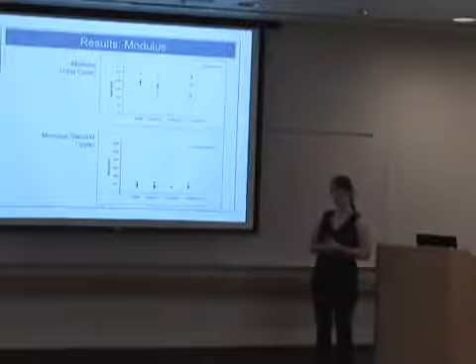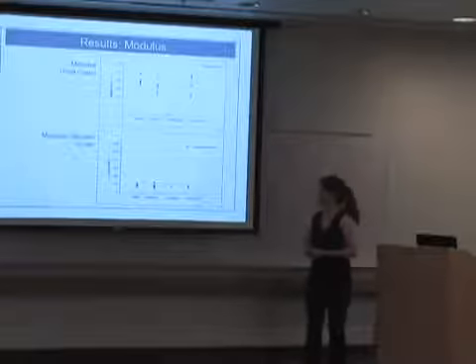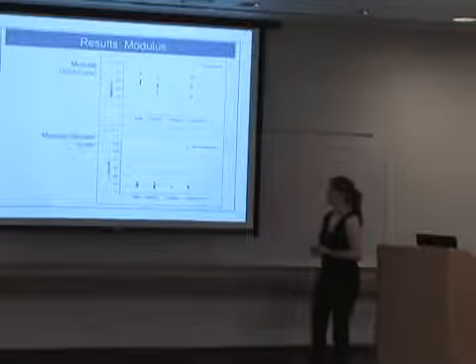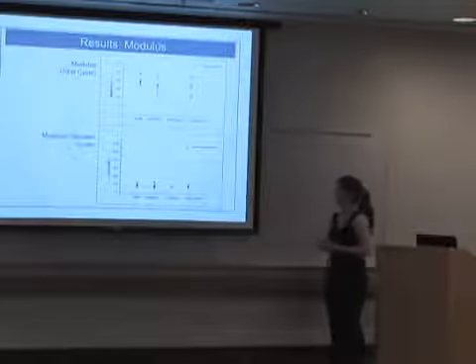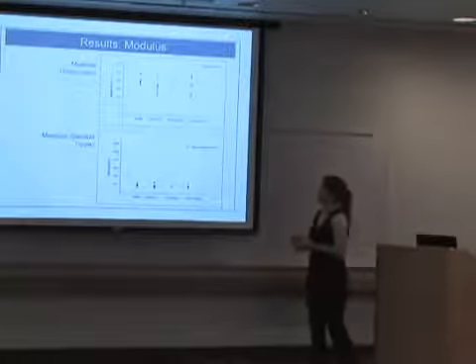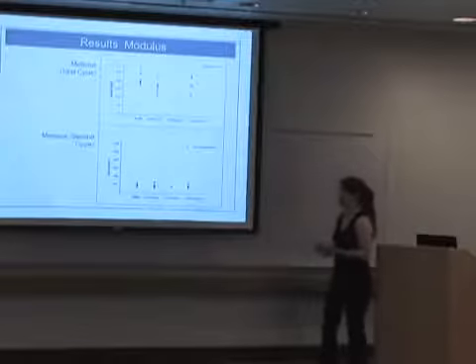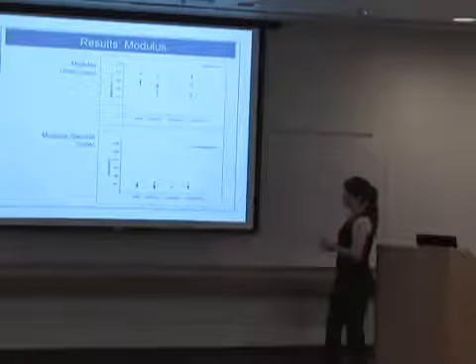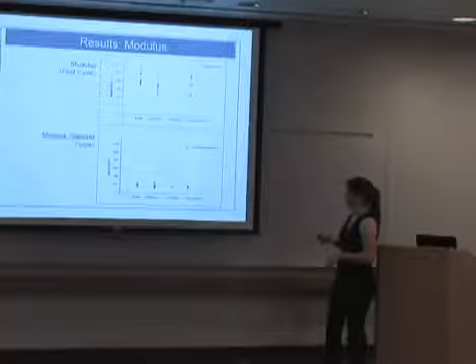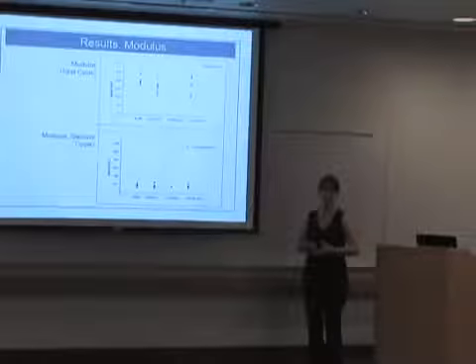So in terms of my results, I got some results that I was expecting and some results that I was not expecting. So for the modulus of the first cycle and the second cycle, you can see there's a lot of variation present. And the averages between the different iron treatments are not significantly different from one another, which is not what I was expecting to happen. Similarly to the first cycle, the second cycle modulus are all pretty much the same for the different treatments, although you can see there has been a significant decrease due to damage to the thread after being stretched in the first cycle.